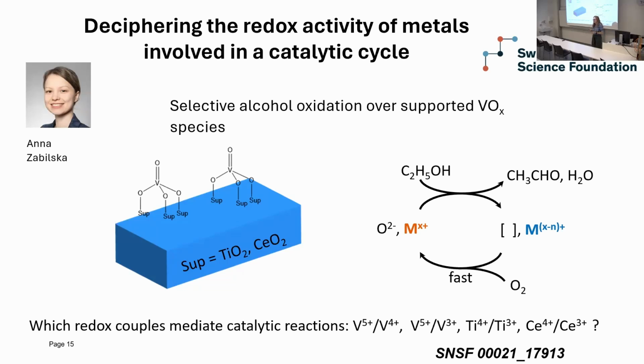It is most probably oxygen bound to the catalyst. This oxygen can selectively oxidize ethanol into acetaldehyde, and a vacancy should be formed, and the charge should be compensated by a change of the oxidation state of one of the cations. So it can be vanadium, titanium, or cerium.